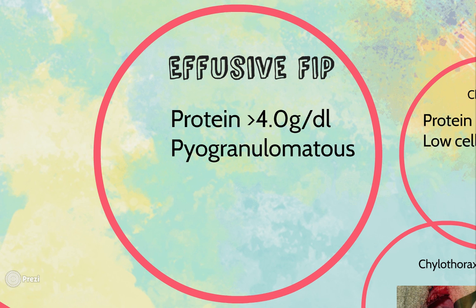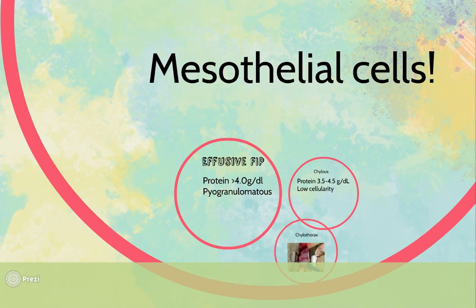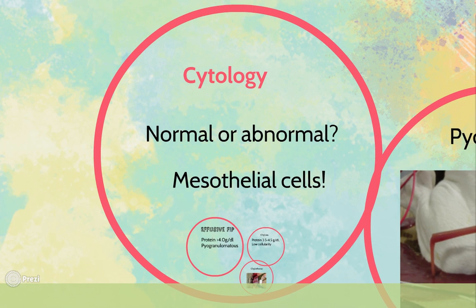So just going back to regular cytology, let's go back here for a second. If you're looking at a transudate, you might see the occasional white blood cell, a couple of mesothelials sprinkling here and there. Modified transudates have those cells, plus you might start to see reactive mesothelial cells, and mesothelial cells will start to become reactive if inflammation is present.